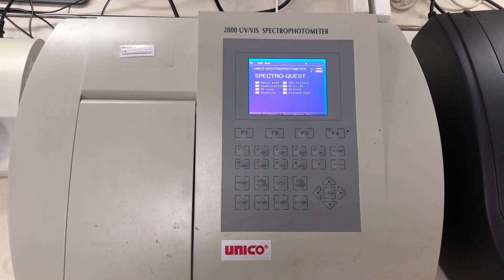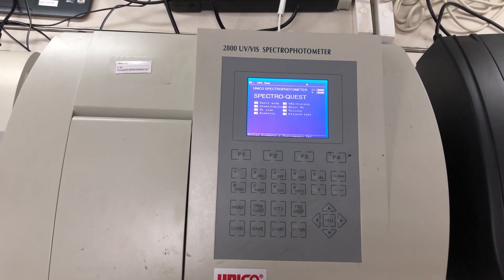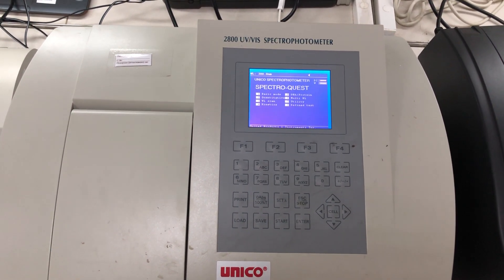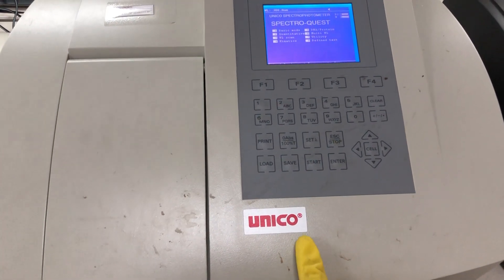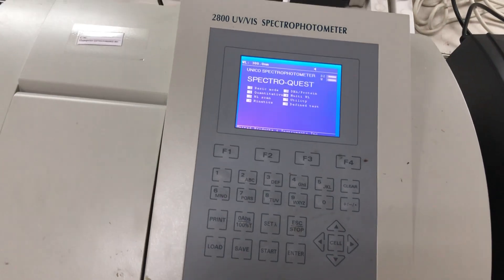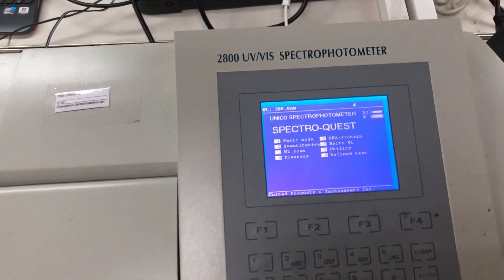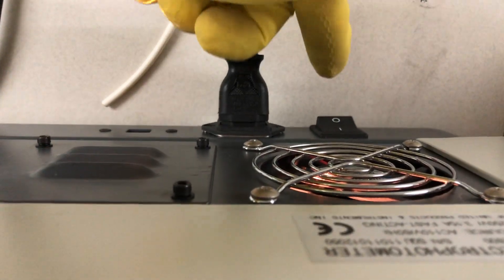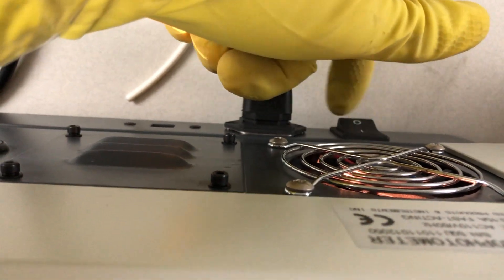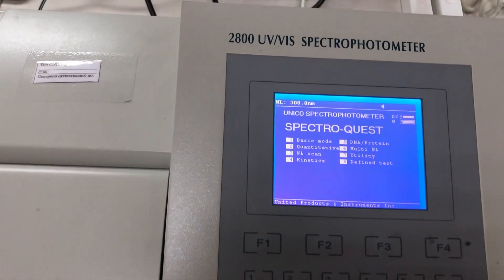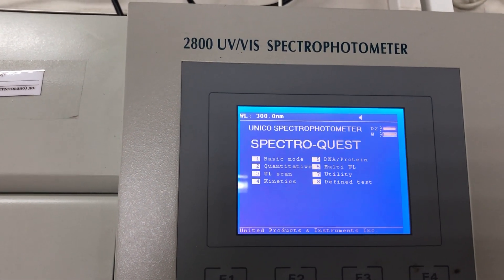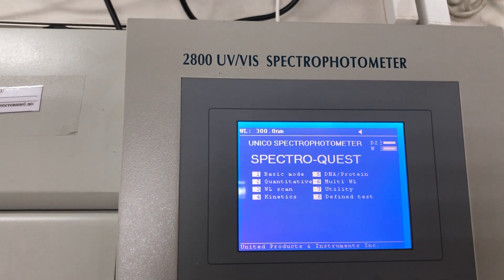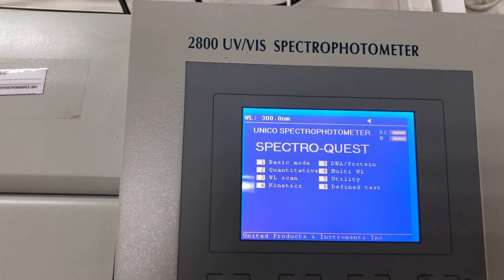Hello, today we are trying to use a UV-VIS spectrometer Unico to detect phenol in solution. First, we have to switch on the instrument from this power button and wait about 14 minutes to get the instrument warmed up and initialized.